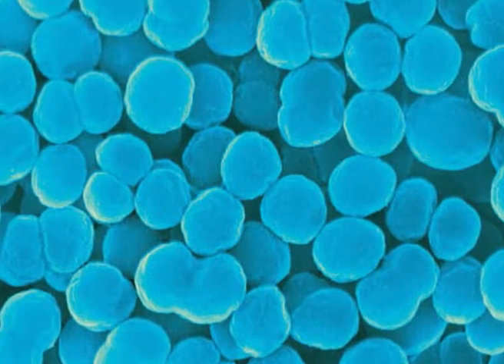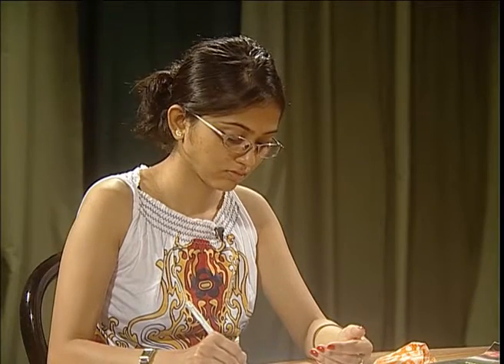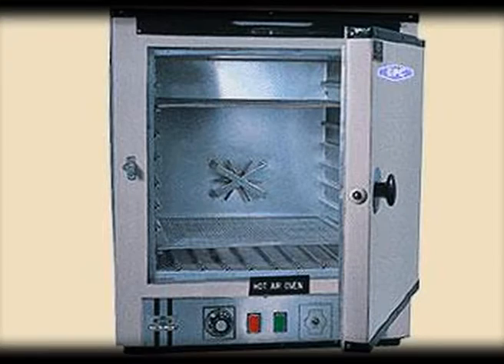Dry heat sterilization needs a temperature of 160 degrees centigrade, and a duration of 2 hours is supposed to be enough to get rid of endospores. But it has certain limitations, because such high temperatures might not be tolerated by other materials like growth media, which cannot be sterilized in a hot air oven.